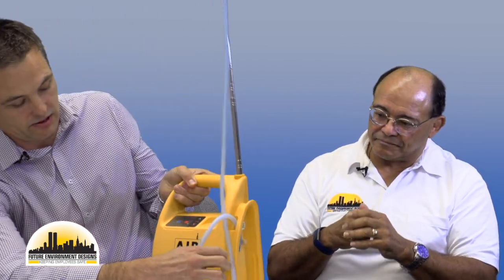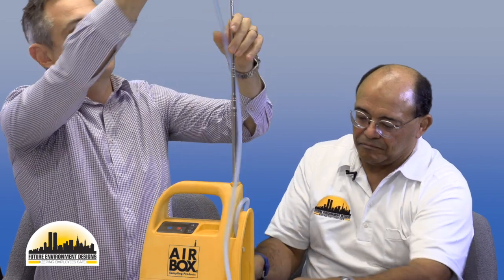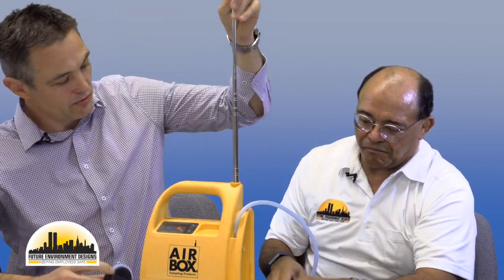Right. That's great. So once you demonstrate the product for us. Absolutely. So this is the new Veriflow model sampling pump. We had this out. We were playing with this earlier. So the pump itself would actually come all set up like this. So looking at it from the point of view of ease of site setup.